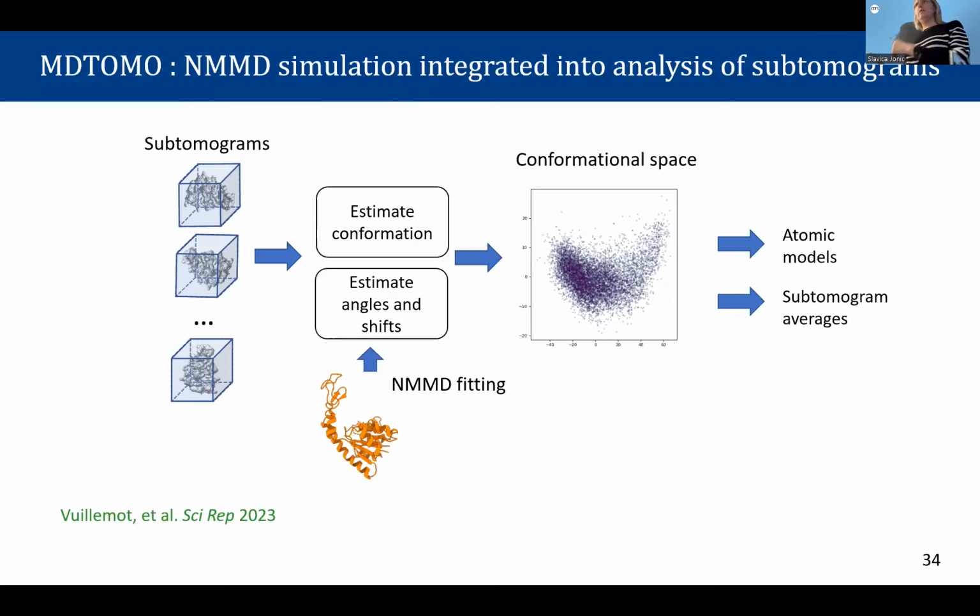Still, we can do something when we have 3D data. Analyzing 2D data of cryo-electron tomography is extremely challenging. Some people are trying to do this, but there is so much noise. We so far didn't try. But on the 3D tomogram data, we can still extract something. And so we extend MD space to tomography. It works very similarly to MD space, but it analyzes 3D data.